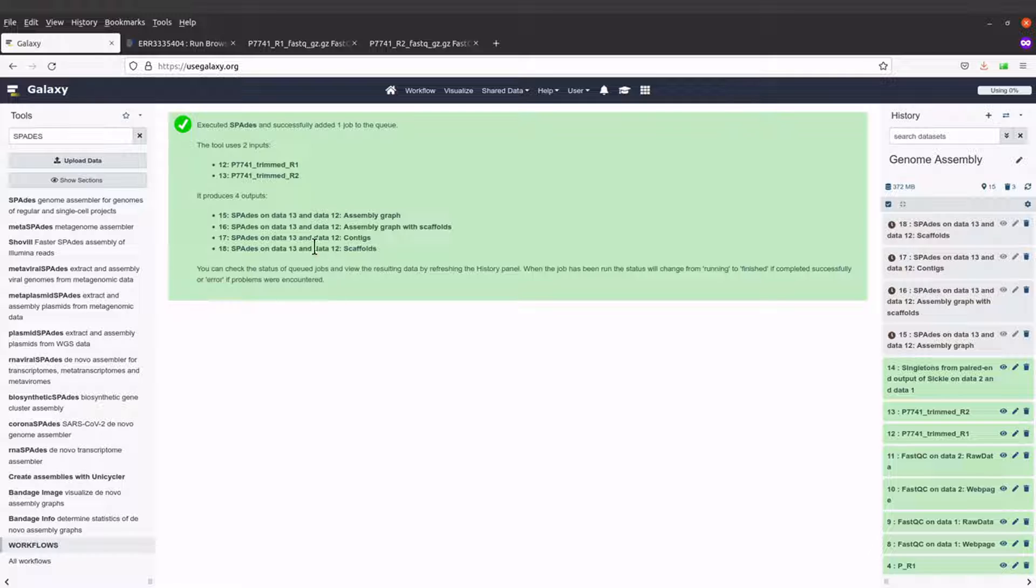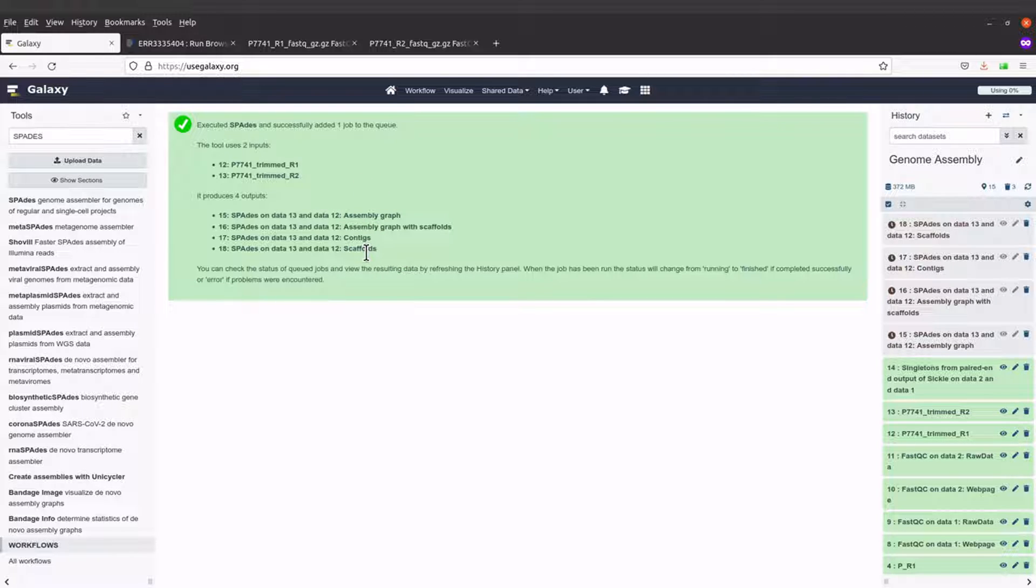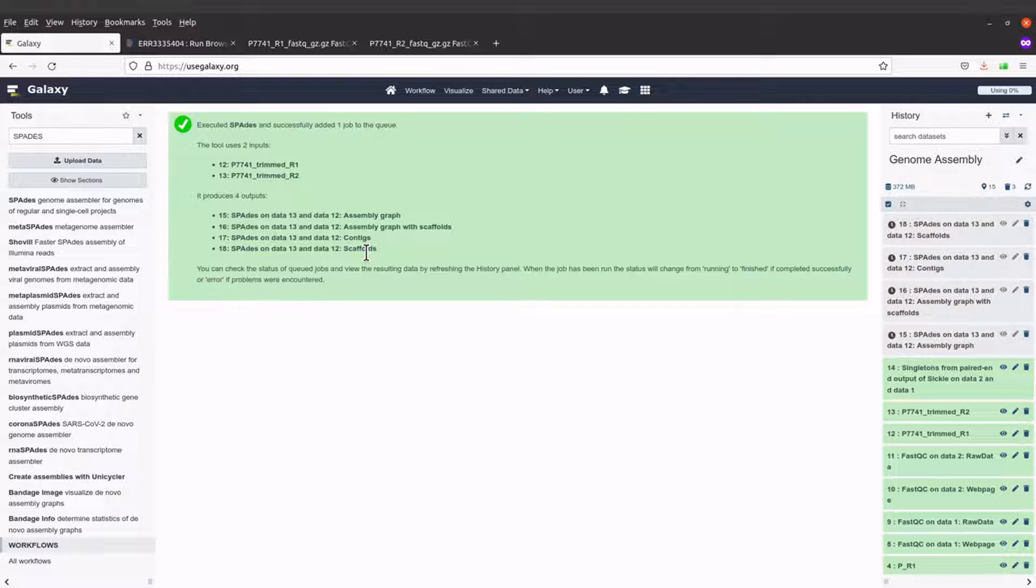Once you have your genome assembly done, you have the scaffolds. Let's wait whilst genome assembly is being done.